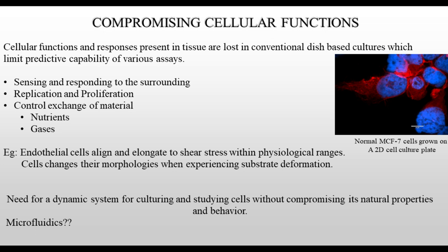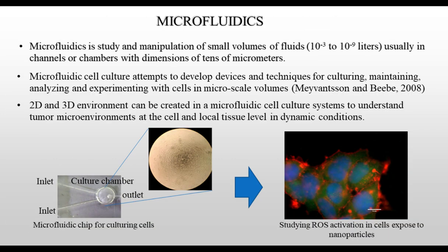So how can we study such dynamic systems? One of the answers is microfluidics. So what is microfluidics? Microfluidics is the study and manipulation of small volumes of fluids in channels and chambers with dimensions of tens of micrometers. Microfluidic cell culture attempts to develop devices and techniques for culturing, maintaining, analyzing, and experimenting on cells in microscale volume.